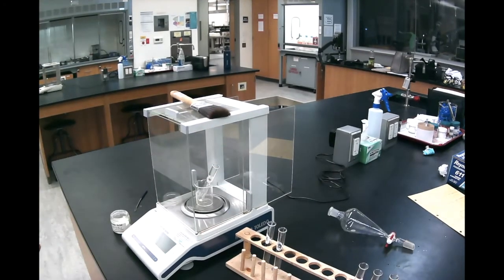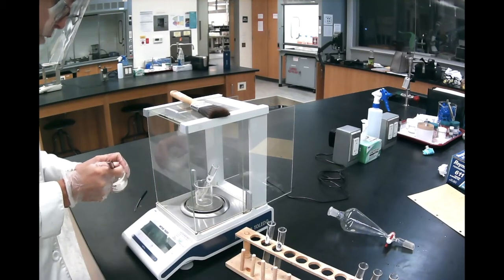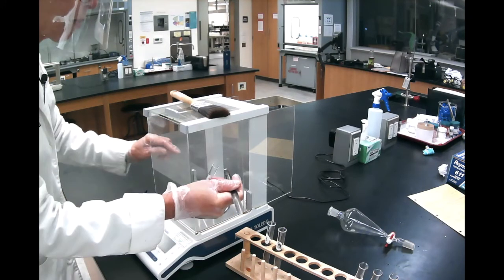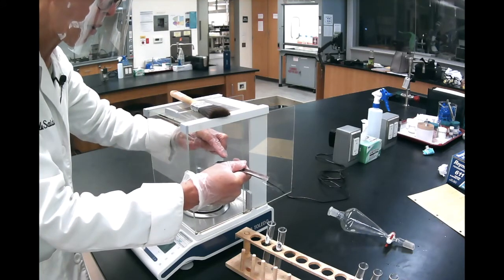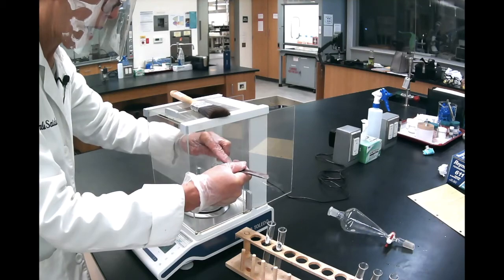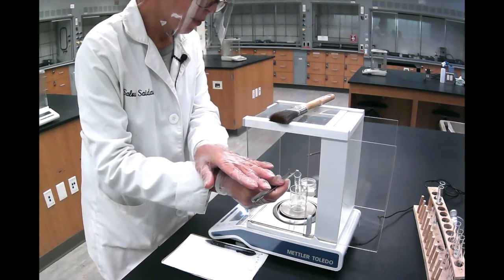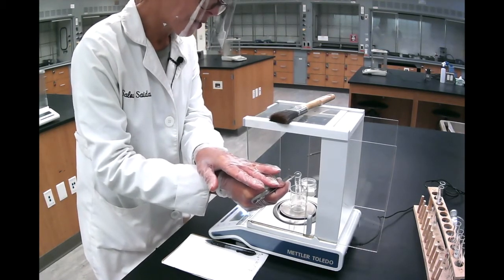So it says 44.47. I'm still far from 44.57. So again, a tiny bit on the tip of the spatula, and without touching the beaker or the test tube, you just tap slowly, allow the powder to go in. So I'm still at 44.48. I want to go to 44.55. So again, I'm just tapping very slowly.